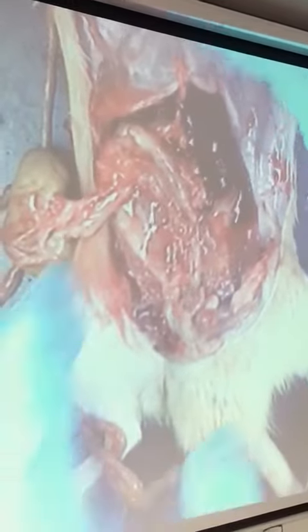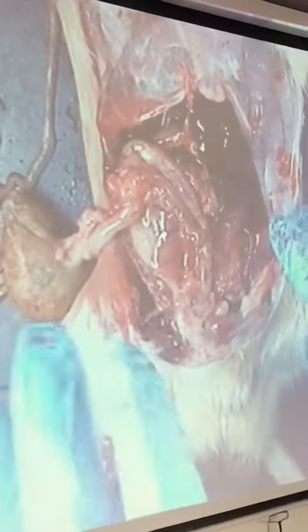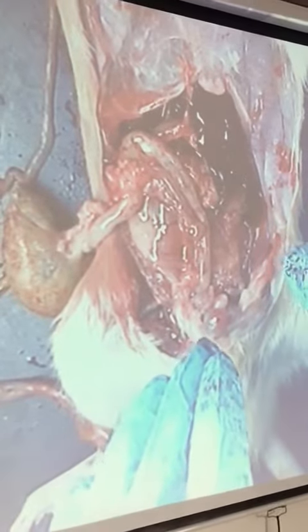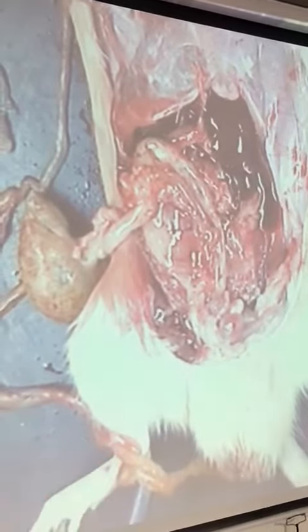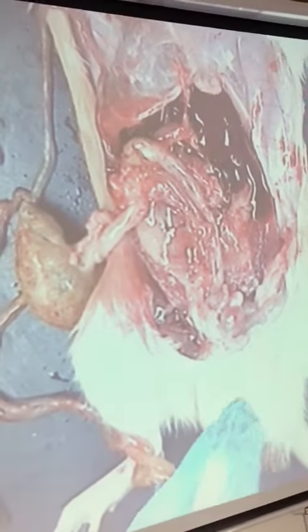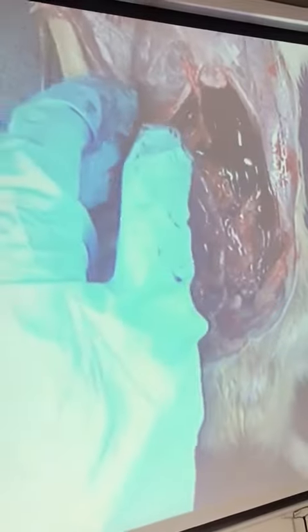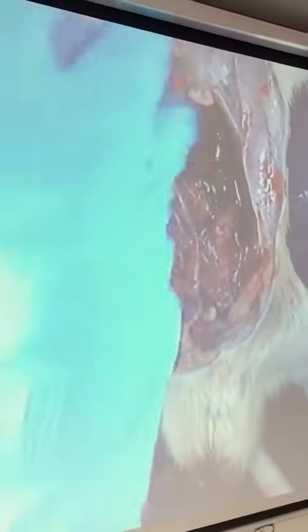You want to start to open up here. Make sure that the rest of the organs are intact. Now you cut up the ribs.